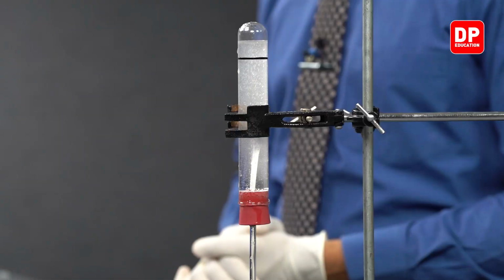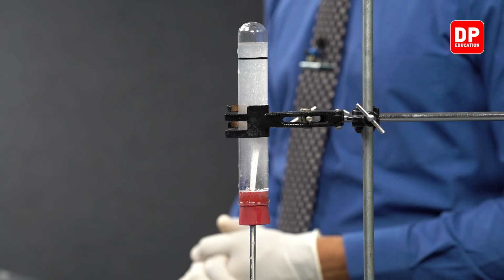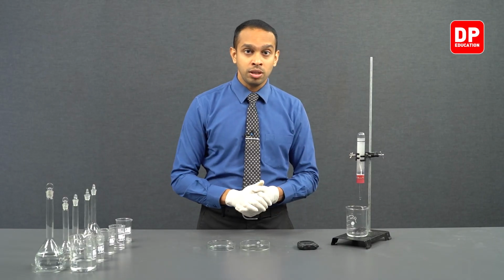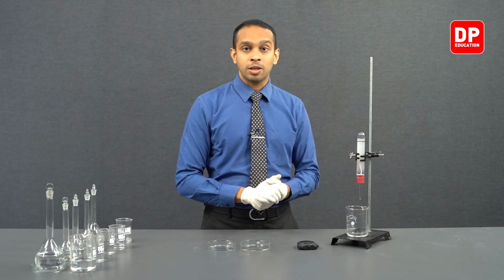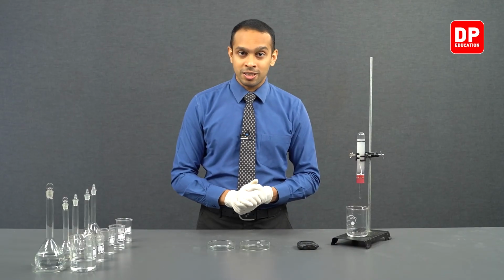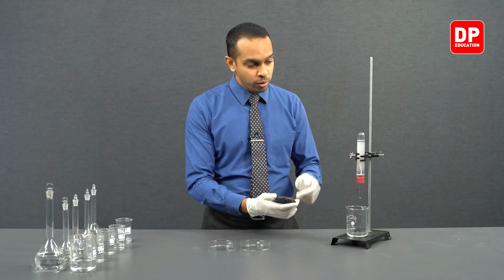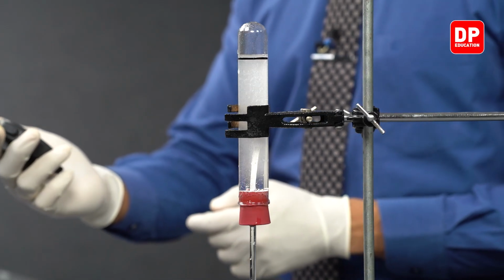As you can see, compared to the previous reaction, this reaction is happening a little faster. Actually, the previous reaction used 0.2 moles per decimeters cube concentrated HCl. Now, this HCl solution is 0.4 moles per decimeters cube concentrated, meaning this HCl solution is twice as concentrated compared to the previous solution. So you can observe the reaction rate is somewhat higher. We are coming close to collecting hydrogen gas all the way up to this line, so we will be ready with the stopwatch.